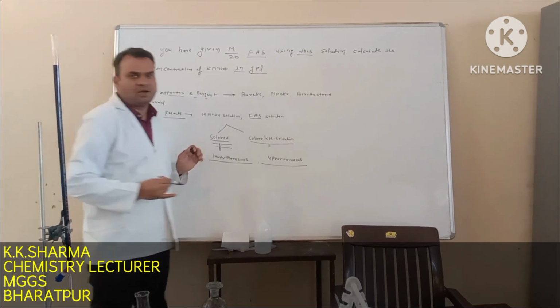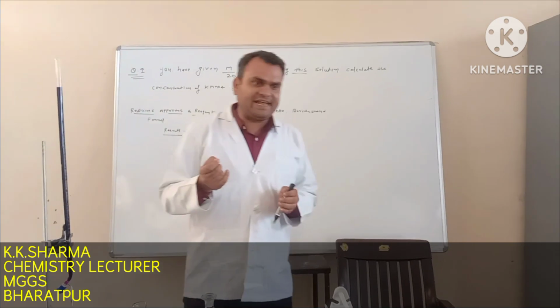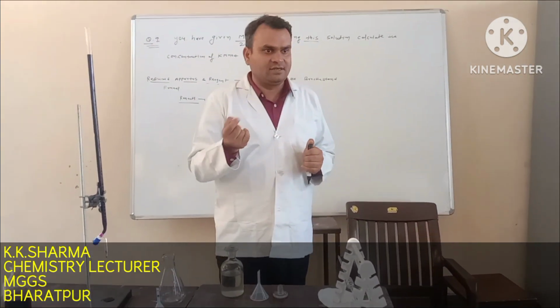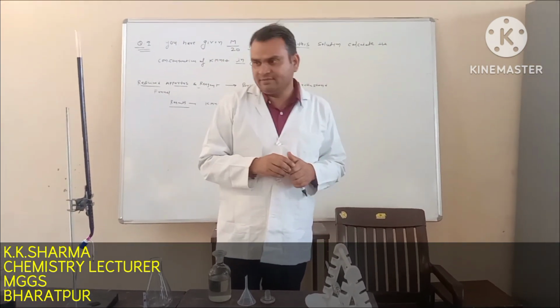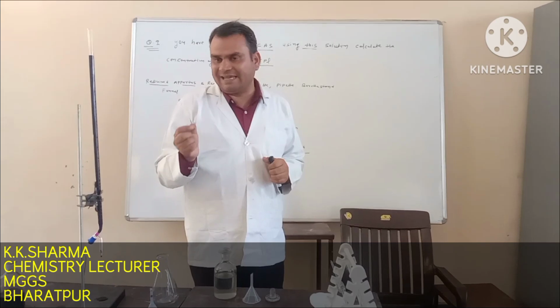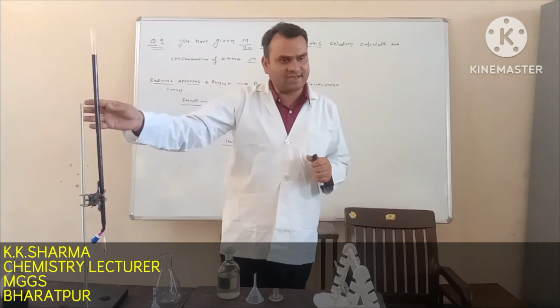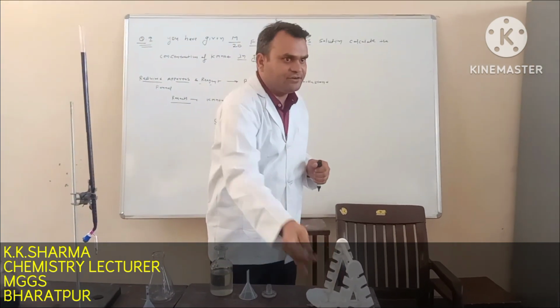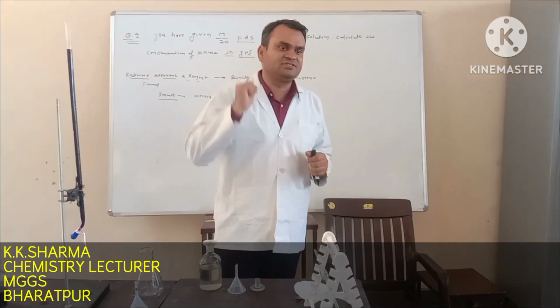What do you mean by the upper meniscus and lower meniscus? When any liquid solution is filled in a capillary tube, due to surface tension, a curve is formed.